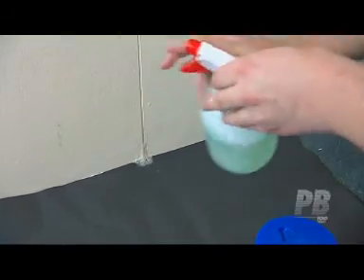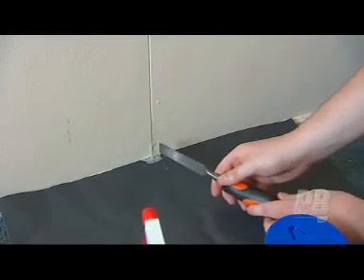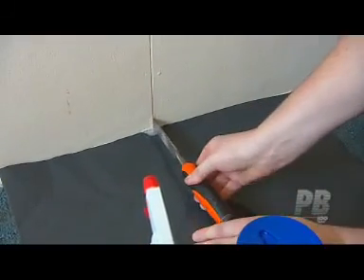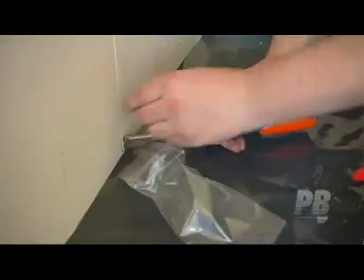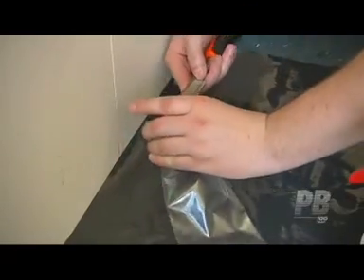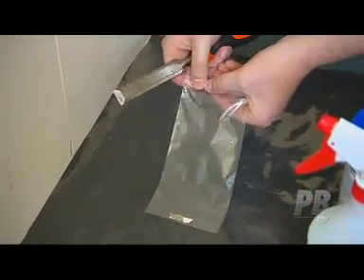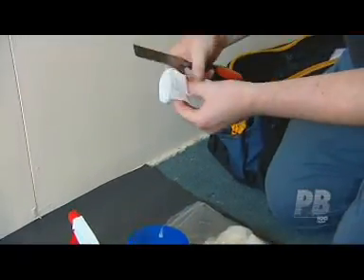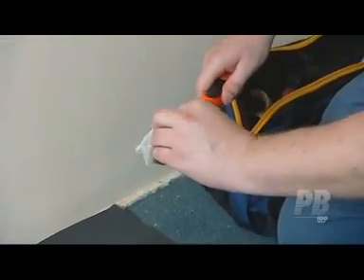Use a suitable hand tool, like non-serrated pliers, a Stanley knife or a chisel, to gently prise a small piece, around the size of a 20-cent coin, away from the suspect material. And place it immediately into a clip-lock bag or small sealable container. Label the sample so it can be identified later and distinguished from other samples. Ensure tools are wet wiped and decontaminated after the collection of a sample.